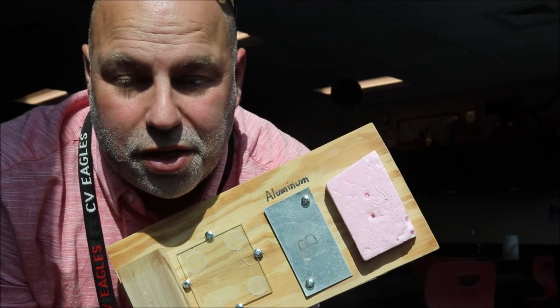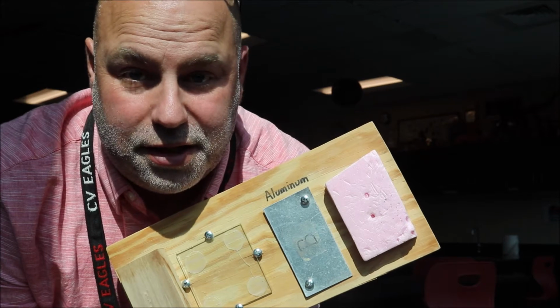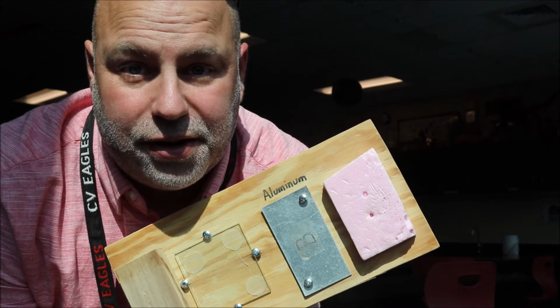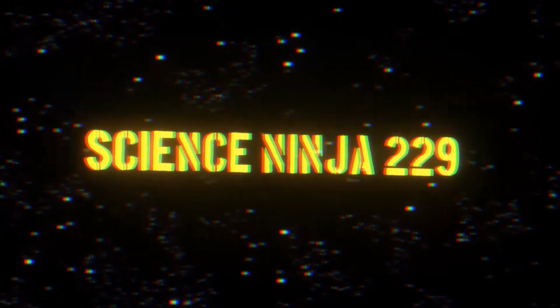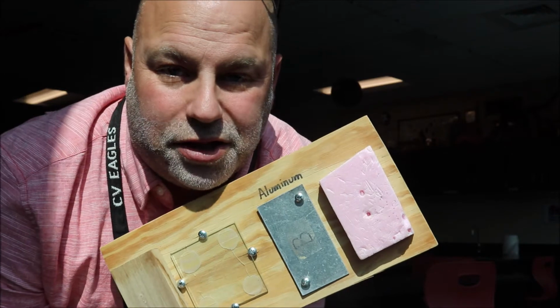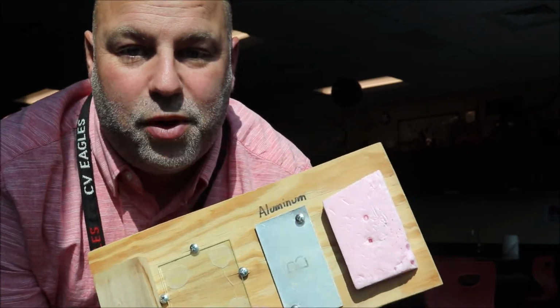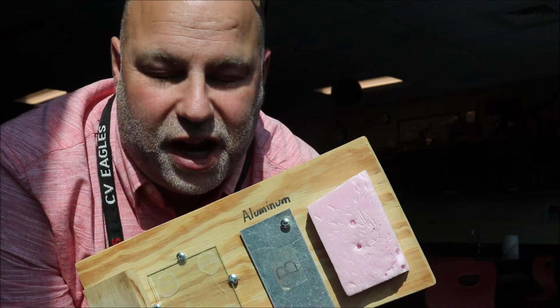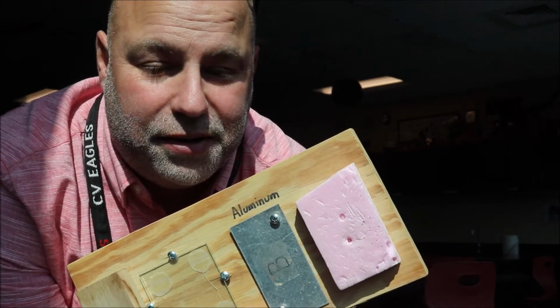Today we're going to do the most boring lab of the year. No, I'm not kidding. This is the most boring lab of the entire year. Alright, so today what we're going to do is the Conductivity Lab. For the Conductivity Lab, we are going to watch ice melt. I know, it's going to be fantastic. It's a good thing you're sitting down. Hopefully you're sitting down for this.